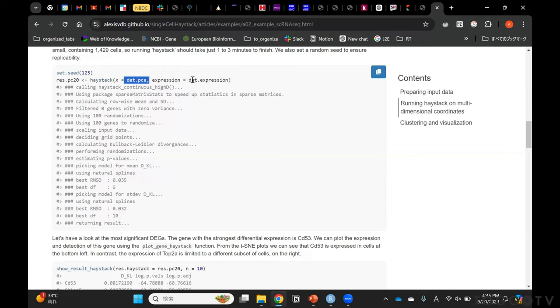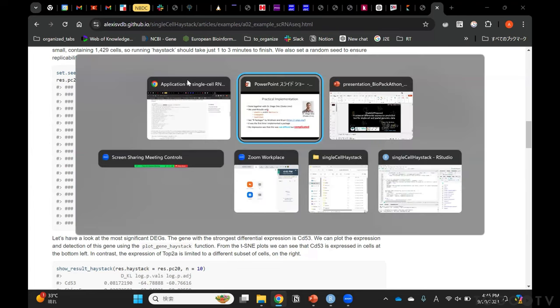Yeah, I understand this cellular distribution is calculated by Gaussian kernel, but how about the expression distribution, the gene expression distribution? Okay. So there too, for calculating the reference, I calculate the distance between each cell and each grid point, and then turn that into a normal kernel. So if a cell is close to a grid point, it will give a high contribution. If it's far away, it will give a very low contribution to that grid point. Maybe the slides are better.